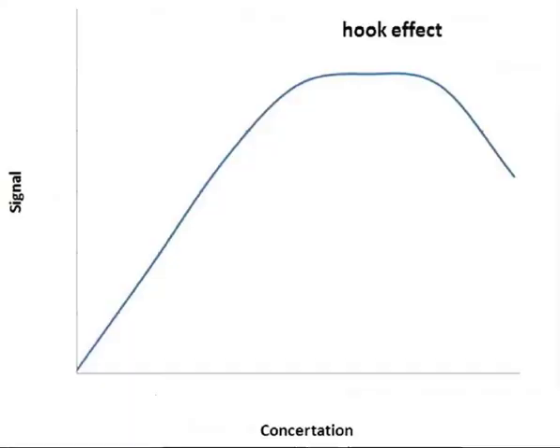Hi, I'm here again, and this time I want to talk about one of the important limitations of immunoassays, specifically something that occurs in one-step sandwich ELISA.